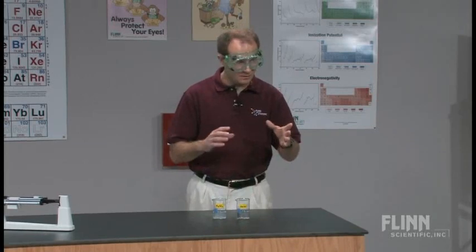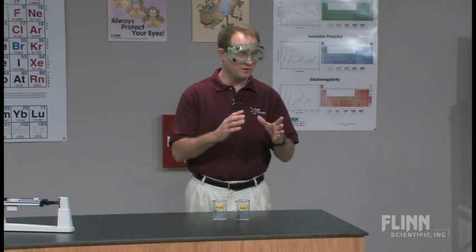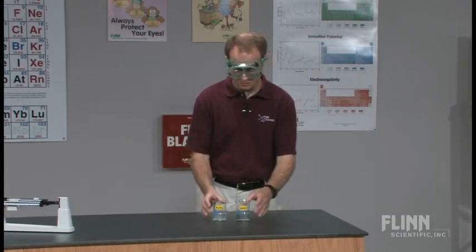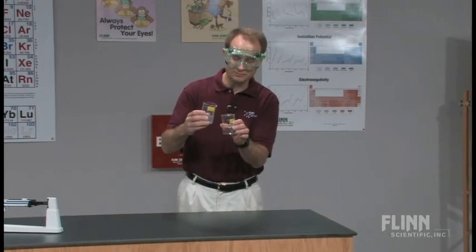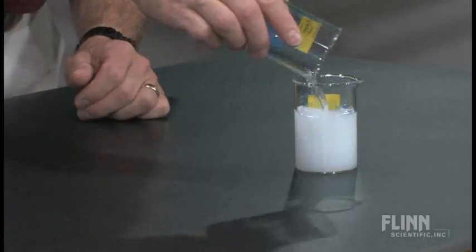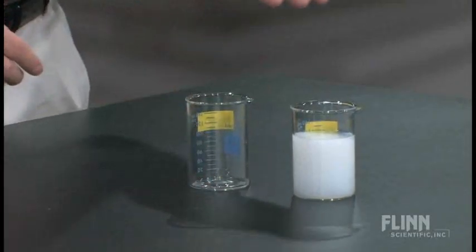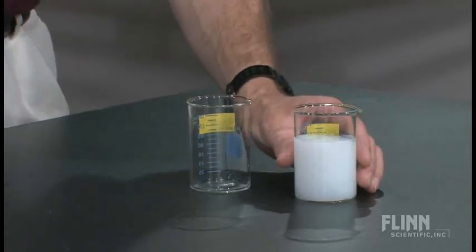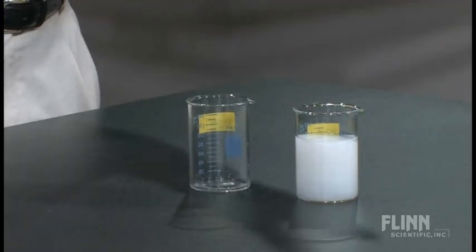And again, what I like to do with this demonstration is review some of the material that we already know and then go the next step and see what they don't know, perhaps. What I'm going to do is simply pour these two together. In fact, let me set that down like that. Part of the scientific method is making good observations. What we see here would be the formation of a white precipitate.